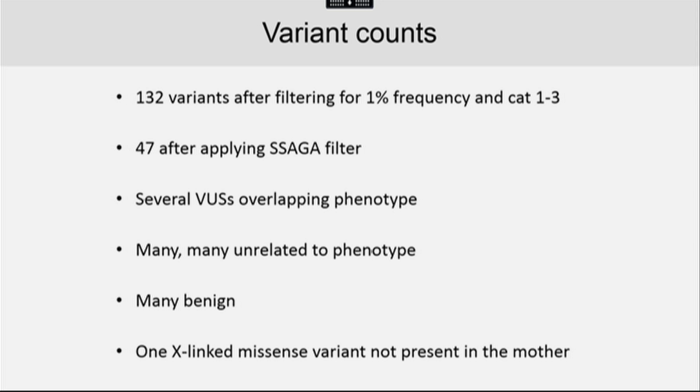And that's a good sanity check when you're working on cases. If you're going from case to case and maybe you forgot a filter, when you apply those initial filters, you should have around 130 to 150 variants for an exome using those filters. I should say that's probably for a Caucasian. For somebody of a different demographic, potentially it's more.